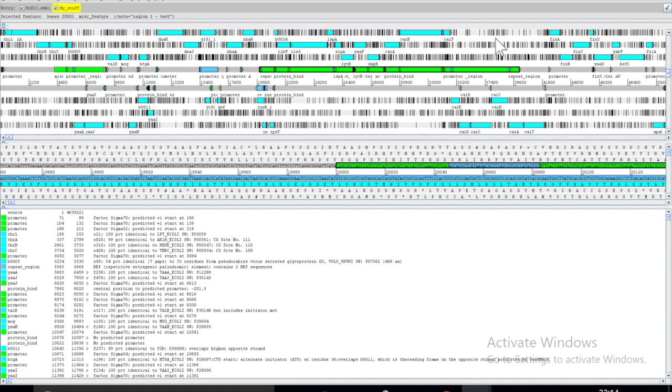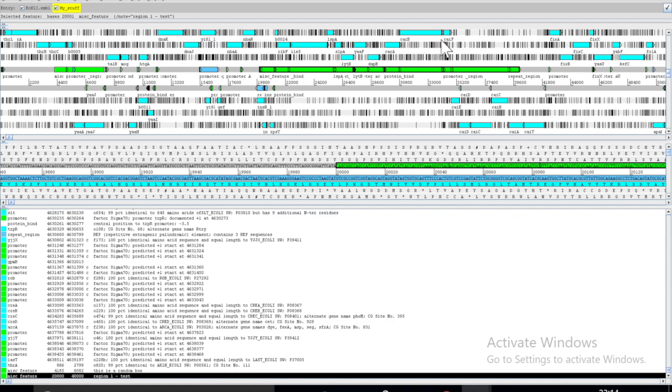So now I've got this region, I can find a specified region within this genome and work on that by itself. And I think that this is one of the more efficient ways of actually finding a specific region and then keeping it in an active entry so that I can go back to it and find it again.